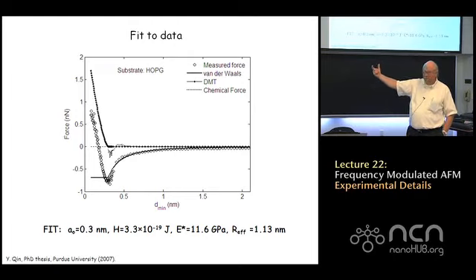So the tip amplitudes that scientists are using now to achieve these atomically resolved images, those tip amplitude oscillations are sub-nanometer. They're actually picometer tip amplitudes. And that basically means you're allowing the tip to roll back and forth sinusoidally in that very nonlinear potential well.